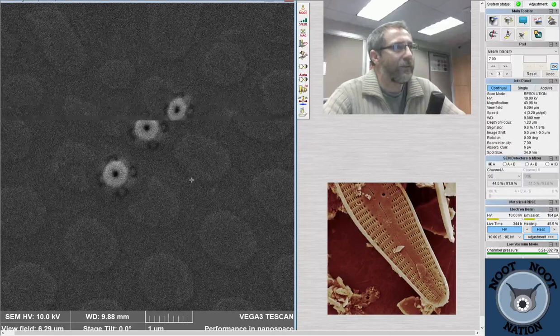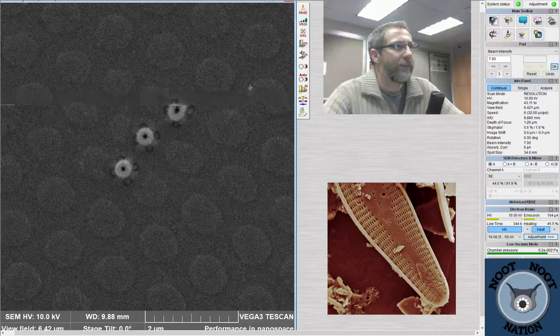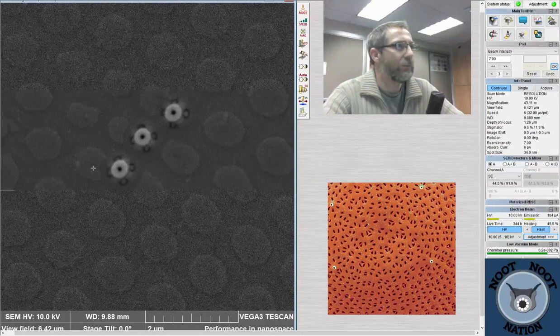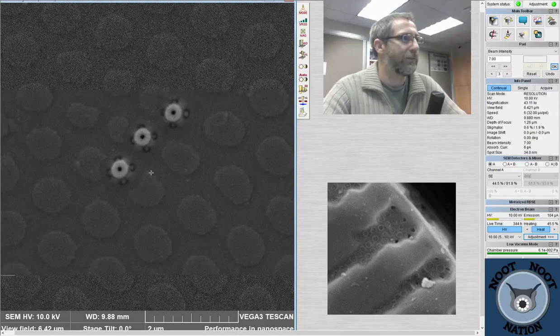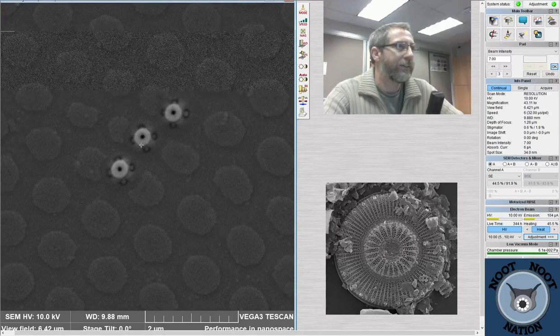In a perfect world where everything is looking great on the SEM, the surfaces of these little blobs that you see, they're actually sort of hexagons that are filled with some sort of a structure, would be clearly resolvable as little polka dots. You can see like a salt and pepper shaker head. These are what are called cribra, a type of covering that goes over the areolae of diatoms, the holes that go through the valve.